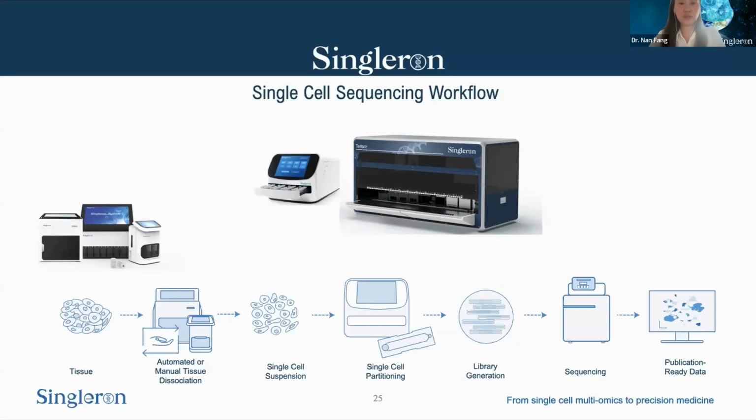And another possibility is that even with short read sequencing nowadays, it is possible to sequence a little bit longer than PE 150. So if this could be extended, that could also help assembly. But the typical recommendation is PE 150 and 100,000 reads per cell.